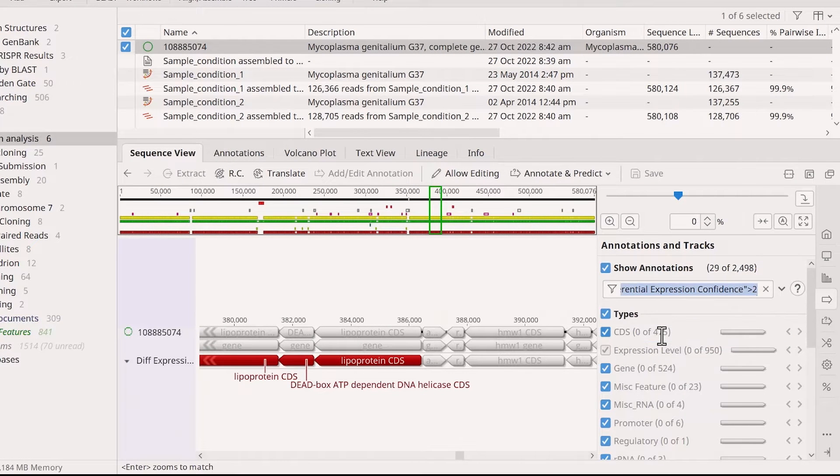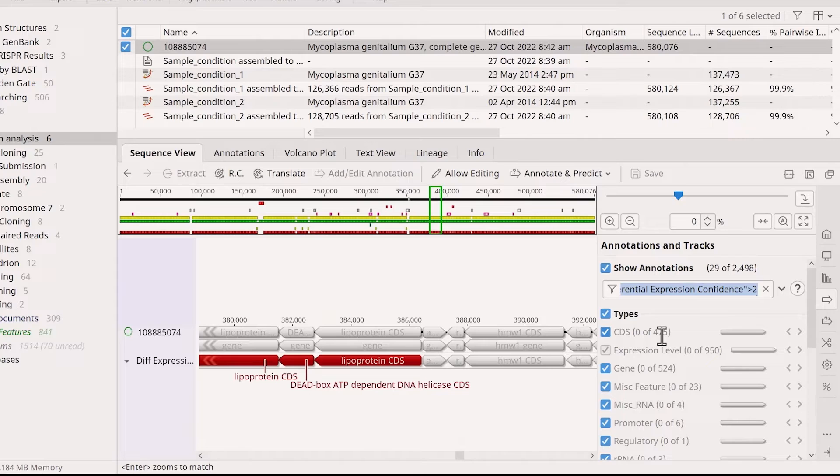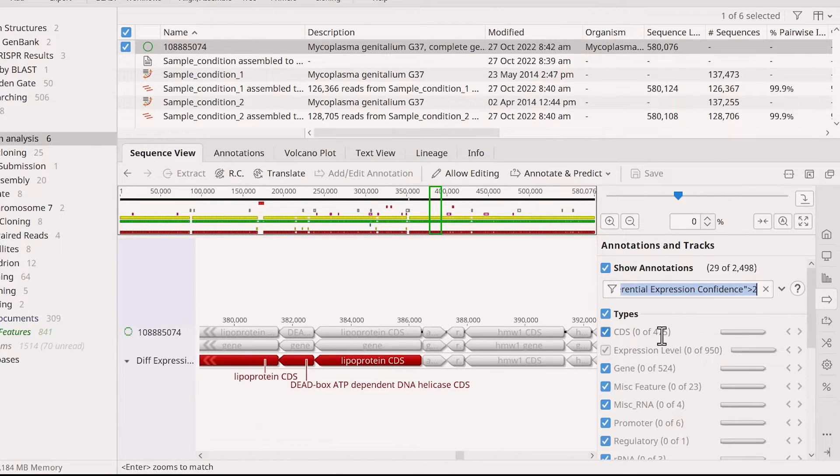This equates to a p-value of less than 0.01. So, the track will only show genes that are significantly overexpressed in sample condition 2 than in sample condition 1, at p less than 0.01.